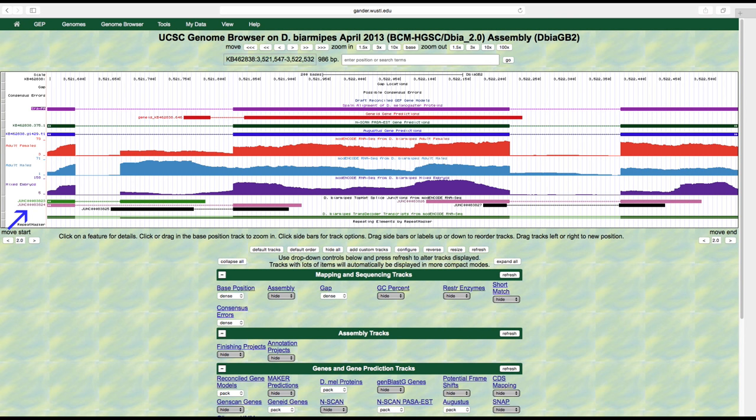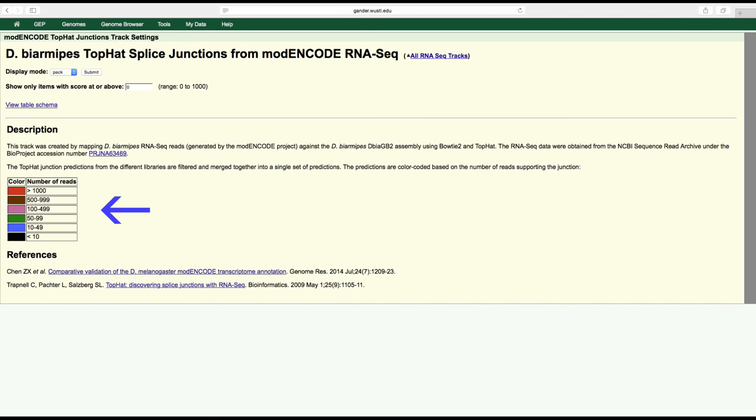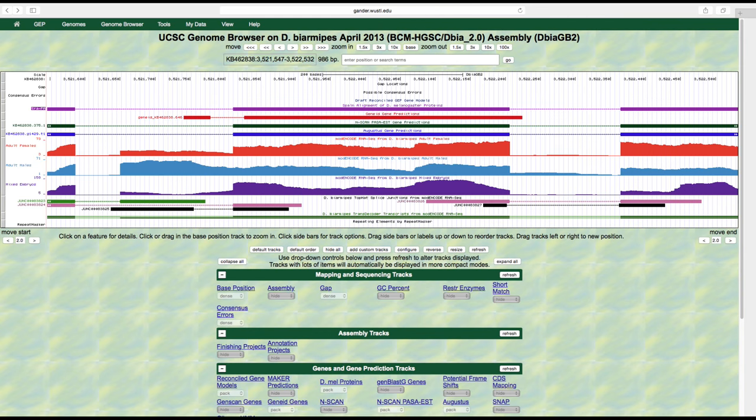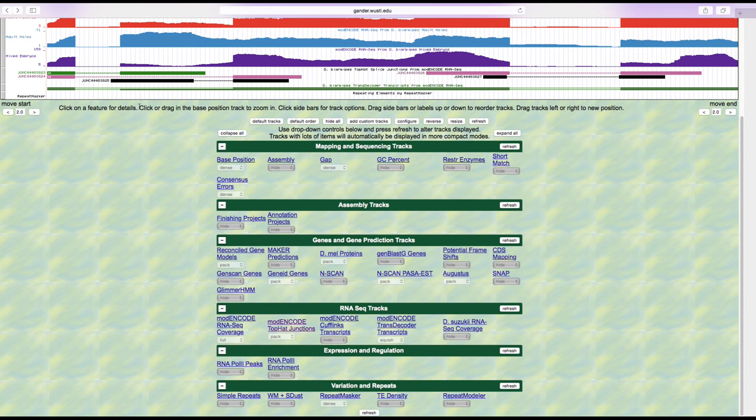In order to create this track, splice junction predictions from the different libraries are filtered and then merged together. The predictions are color coded to indicate the number of spliced RNA reads that support the predicted splice junction. Red indicates that there are more than one thousand spliced RNA-seq reads supporting the junction, followed by brown, pink, green, blue, and black in descending order, with black corresponding to fewer than 10 reads.